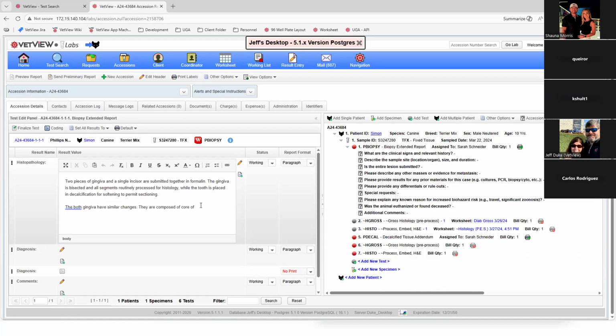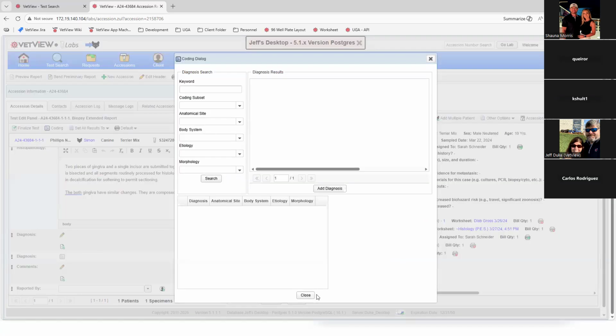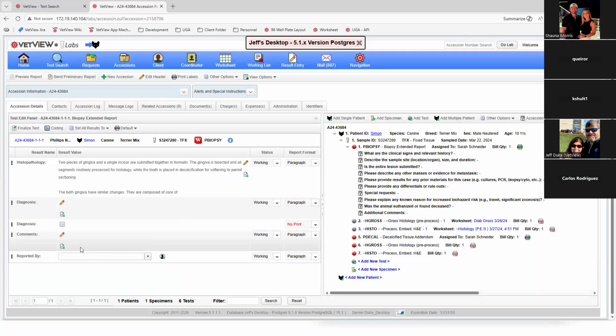Now, also with pathology style cases here, there are also diagnoses. We talked a little bit about that before, but you may have the standard diagnosis fields as well. You'll also find things like signature boxes. So again, as the different data types are in that view, we try to make the screen dynamically change to show you what kind of data we're expecting. Is it a number? Is it a small text? Is it a rich text for paragraphs?